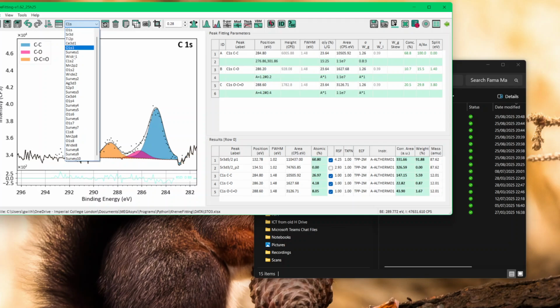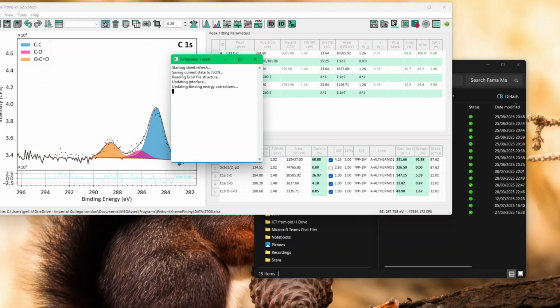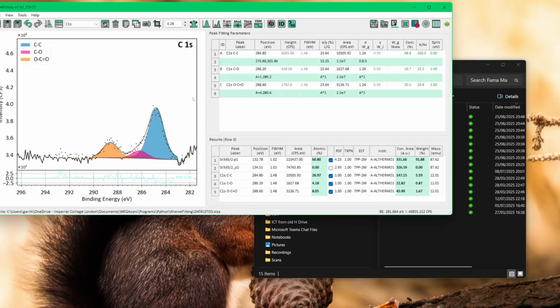Okay. And that's it. And if you have a mistake in your file, that you have a data entry error, you can use this button here, which is a refresh Excel. So that will look at all the structures and see if there are any problems. Okay, and that's usually solving it. So after that, usually you save and you reopen the file. That should just have gone. So that's to sort all the errors.